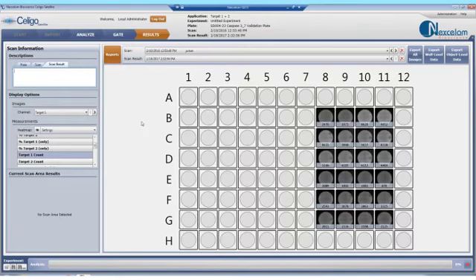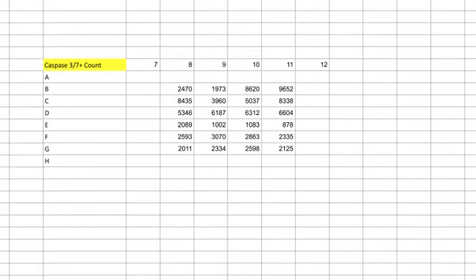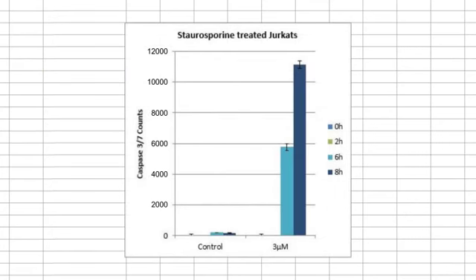All the data can be exported to Excel as a CSV file in a plate-based layout. Each file that is exported to Excel contains the number of caspase-3-7-positive cells. Generated bar graphs show a time-dependent increase in the number of caspase-3-7-positive cells in the staurosporine-treated samples.